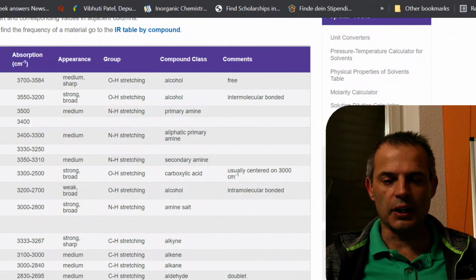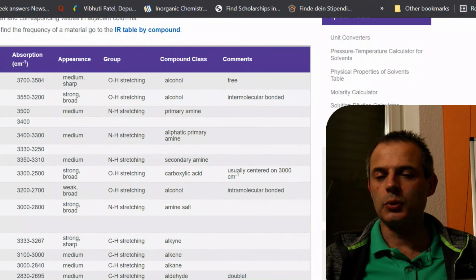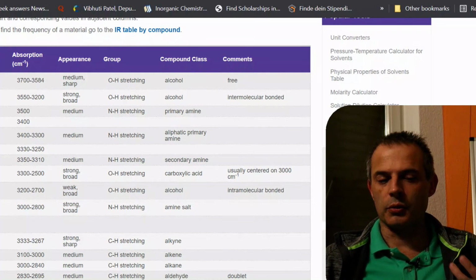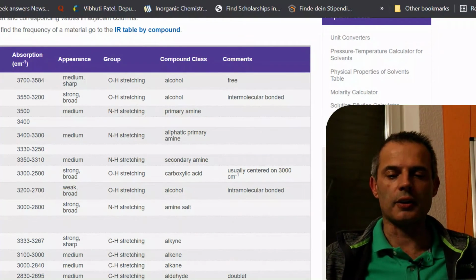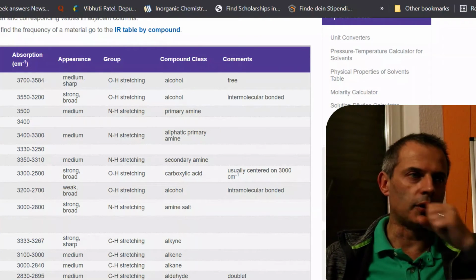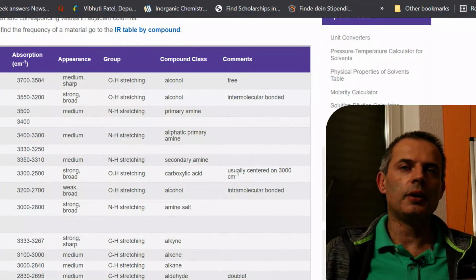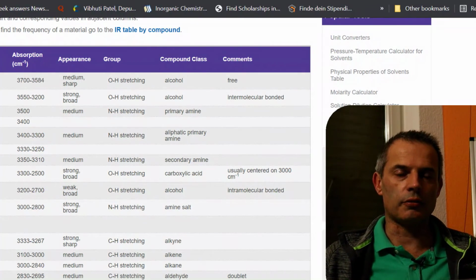It's hard to directly interpret it, but very often we've got an idea of what we've got, because we know what we started with, if we're doing preparative chemistry, or if we're doing a problem or measuring something, we have some other measurement. So typically, in traditional organic chemistry, we would know the elemental composition of the compound.